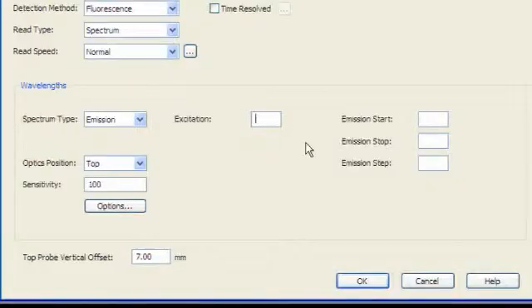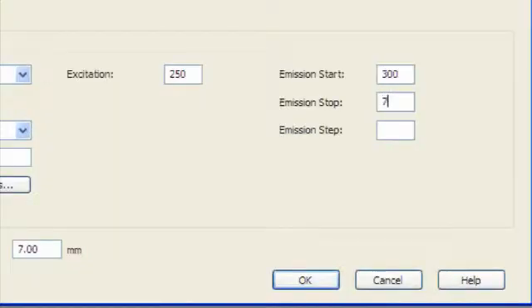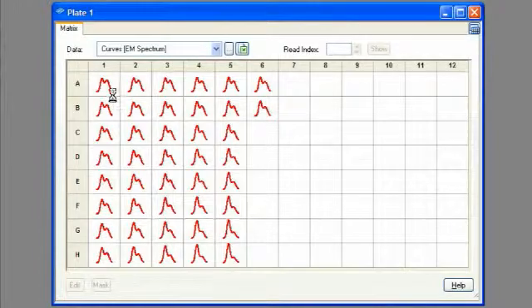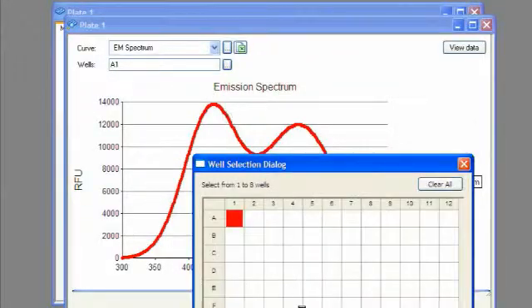Any wavelength from the low UV to the near infrared can be selected through the software, making this system extremely flexible and easy to use for a wide range of assays. Unknown samples can be scanned to establish excitation or emission maxima.